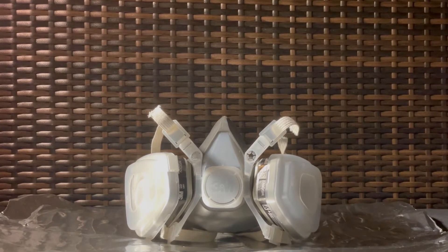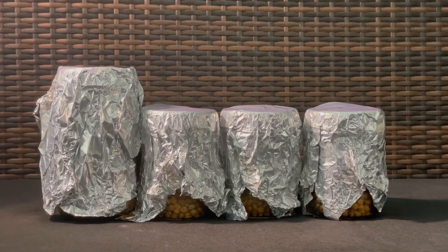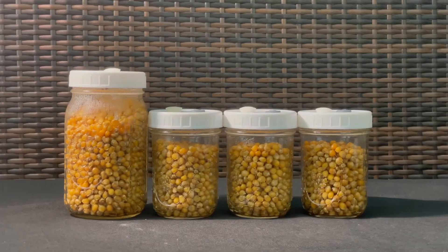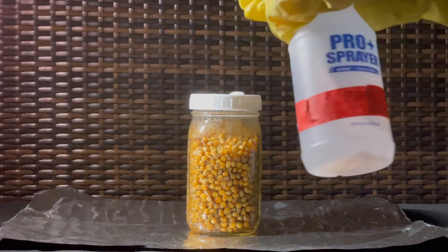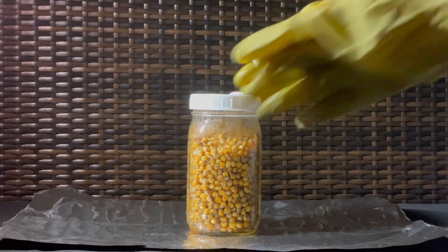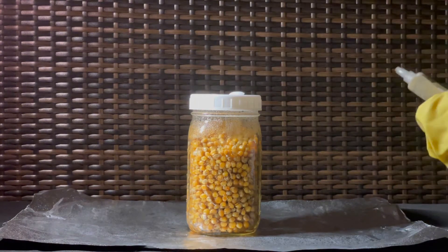Here are the steps you can take. First, once your jars have cooled, remove the foil. Put on your rubber gloves and spray your hands down with alcohol. Place the needle onto your spore syringe and then vigorously shake.